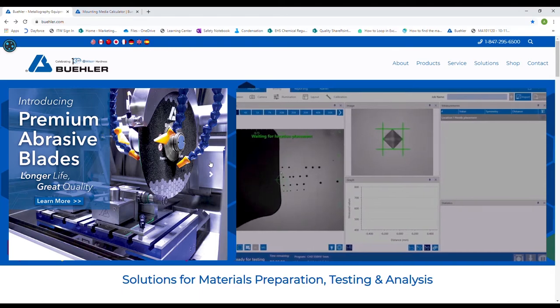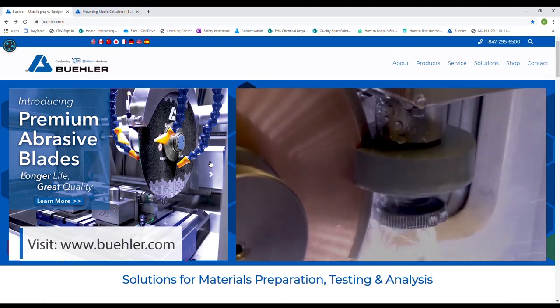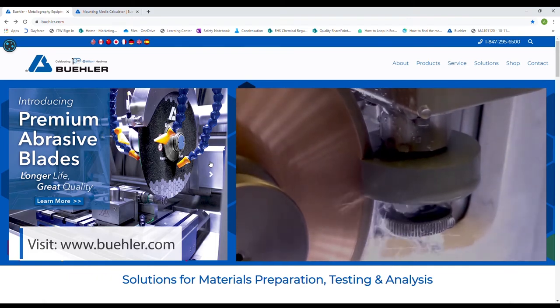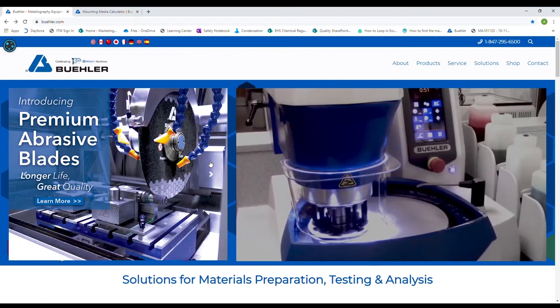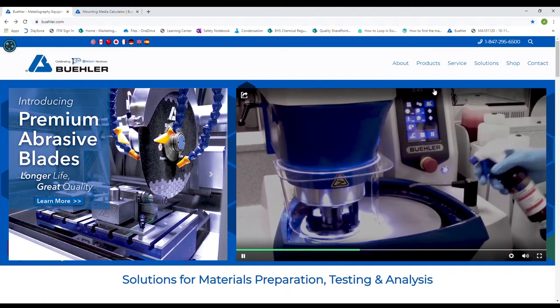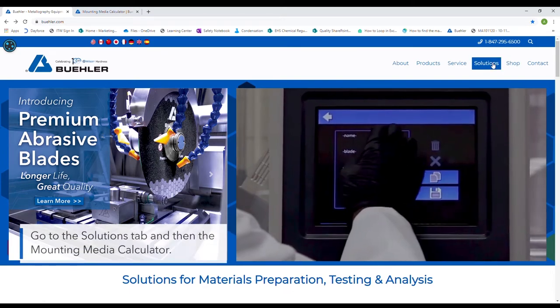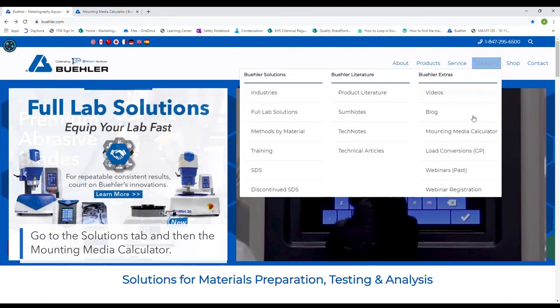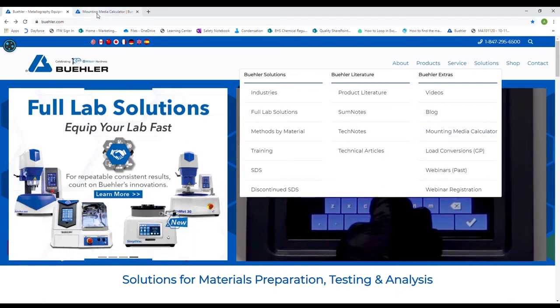The first thing you want to do is determine how much mounting media you're going to use. If you go to www.buehler.com, we have a handy tool that can help you figure this out. Go up to the right hand corner, solutions tab, and then go down to the mounting media calculator.